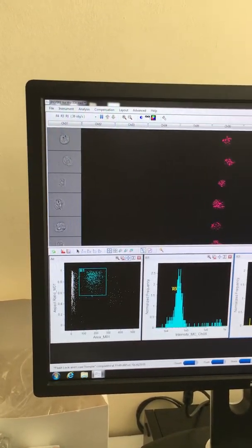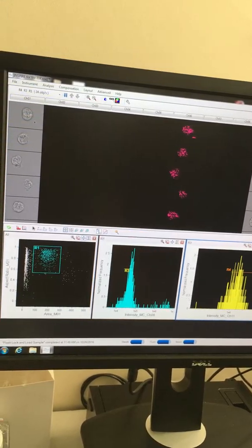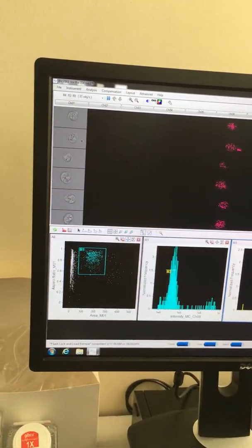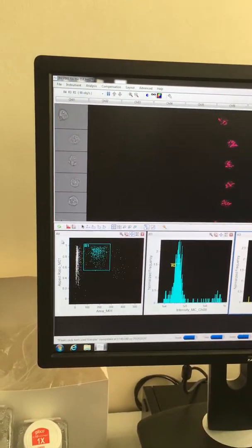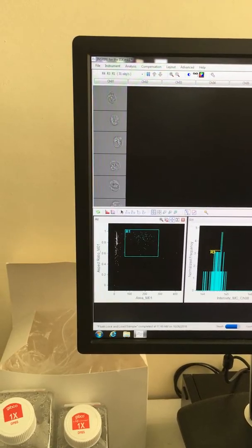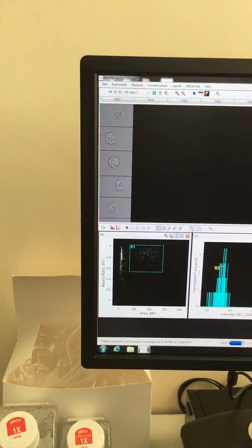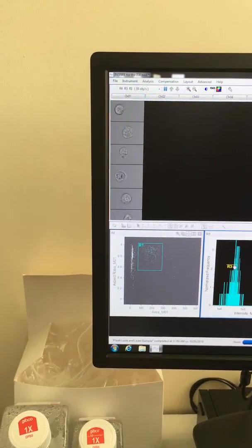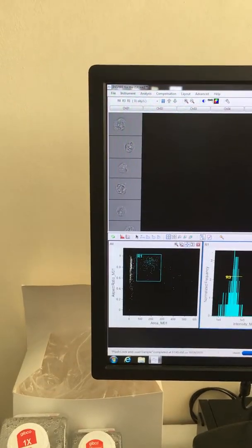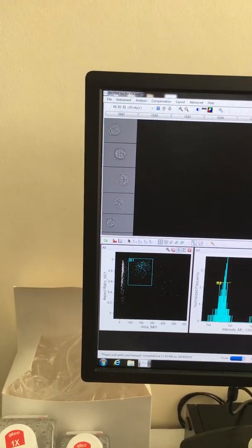Centering okay. So that's great. So then I just press. Can you reset it and then start it again? What, this whole thing? I don't think so, no. Oh, okay. It's continuous, it just keeps acquiring. Oh yes, you can. Hit refresh there. So that's repopulating the graph. That probably needs R3 as well. Your live dead's shifted a bit. Okay. Cool, so I'd hit acquire.